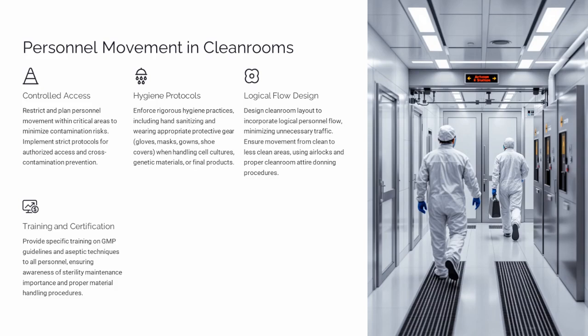Personnel movement in cleanrooms must be carefully controlled to prevent contamination. This includes controlled access, hygiene protocols, logical flow design, and training and certification. These measures ensure a sterile environment.